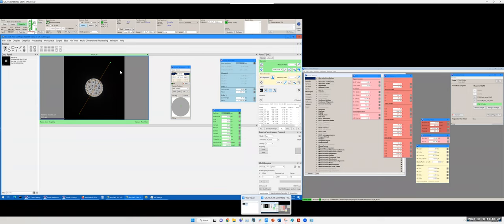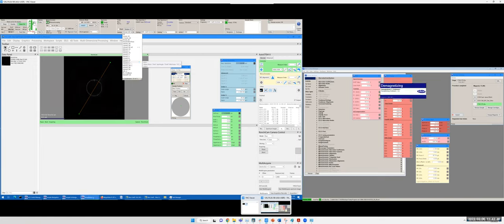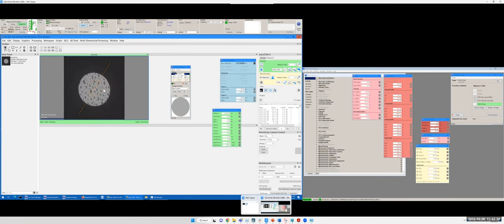Okay, so I can see you're following the logic. Now we want to switch to a high resolution mode. Let's do a high beam current because we're looking at gold. We don't worry about beam damage. So let me think. Okay, maybe we use a lower current mode, because even if you're not damaging it, you will see a lot of single atom movement. So let's do a low current mode where you give less energy to the gold, so they're more stable. So I always prefer lower beam current.